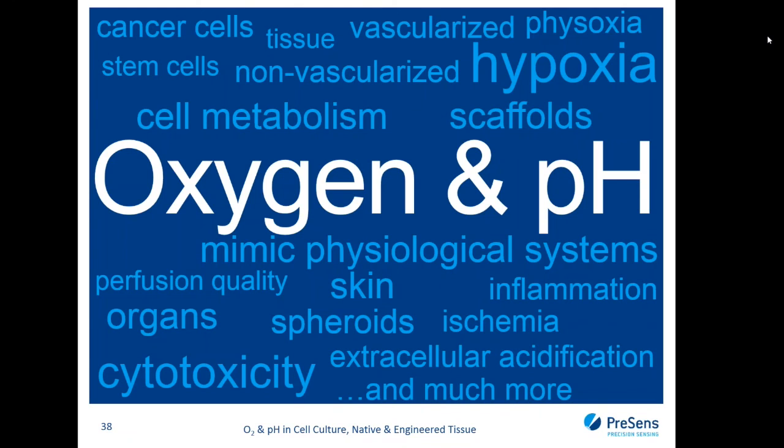Let's start with the maximum sensor foil size. It was presented in the slides with the specs of the sensor foils. The maximum size is up to 40 times 40 square millimeters. If you need bigger areas, you can also write us, because we have customized solutions where you can also record bigger areas. The minimum size of the sensor foil for correct working is, I would say, approximately 1 times 1 square millimeters, because of statistical reasons to make a good calibration and for easier handling. I think if you have smaller sensor foils, it would be hard to glue them inside your vessels.